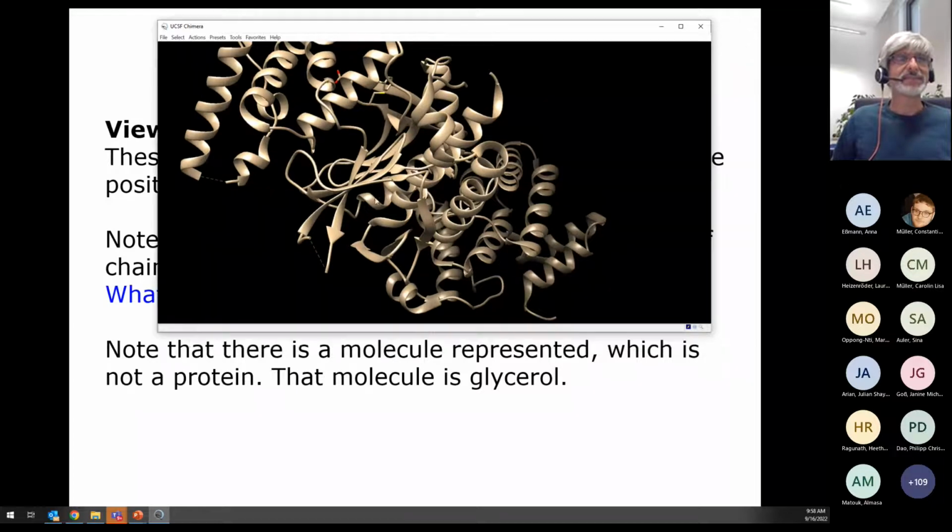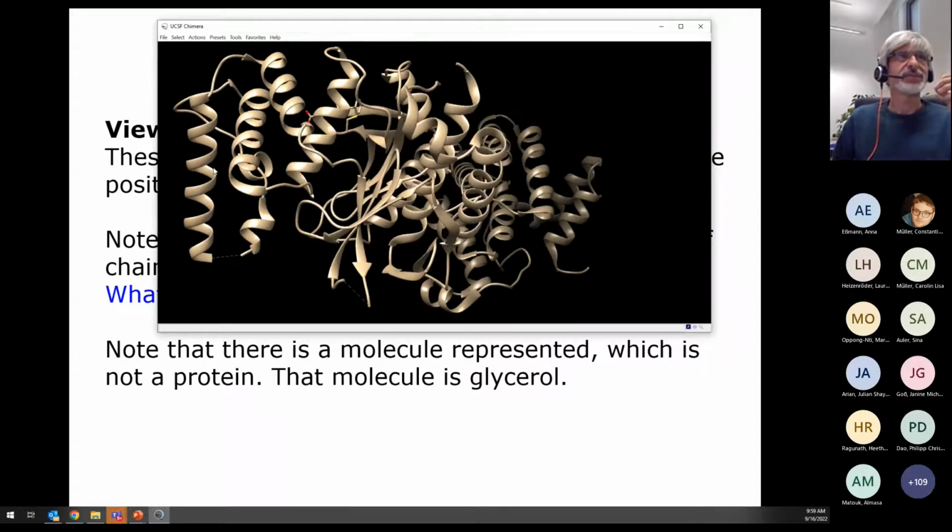And you may have parts of the protein that are so flexible that they cannot be resolved in the structure. The problem with these missing parts is that we don't have atomic coordinates because they are very flexible. So we would not be able to give them a structure like these others. Here we say this is a helix, and it's a helix because it's not moving very much. It will be wobbling a bit in reality, but it's more or less all the time there.